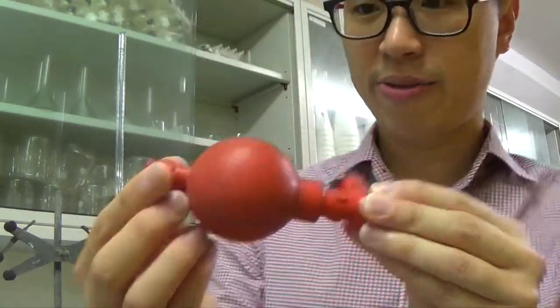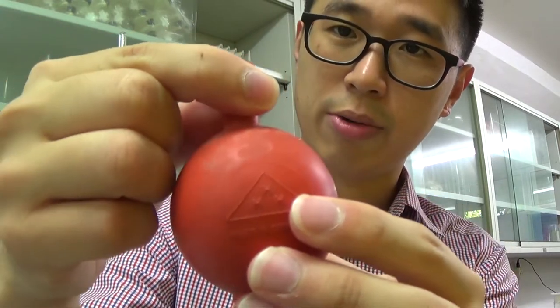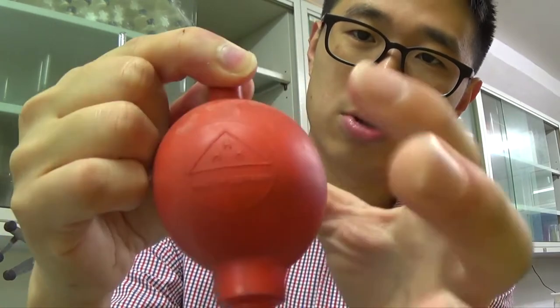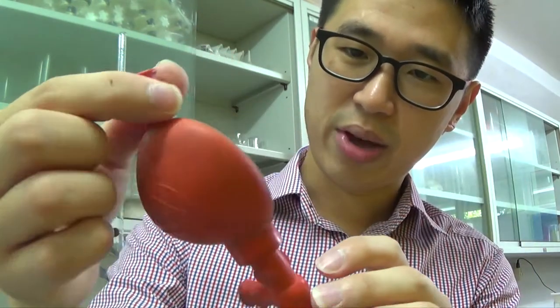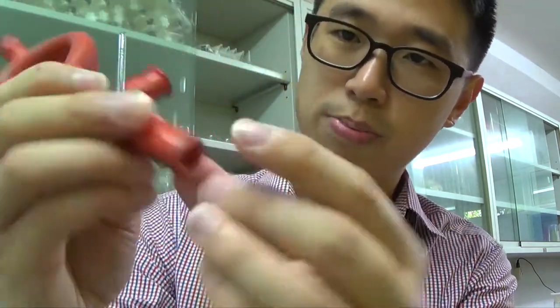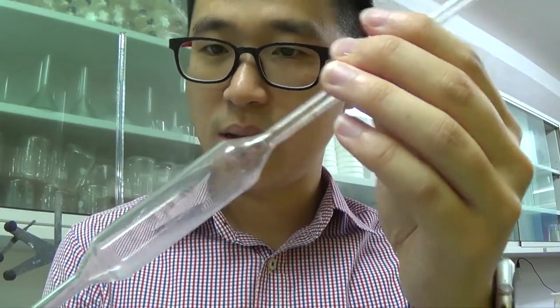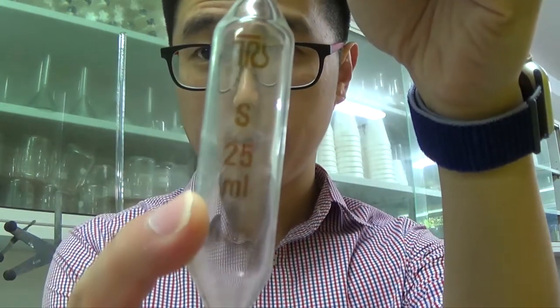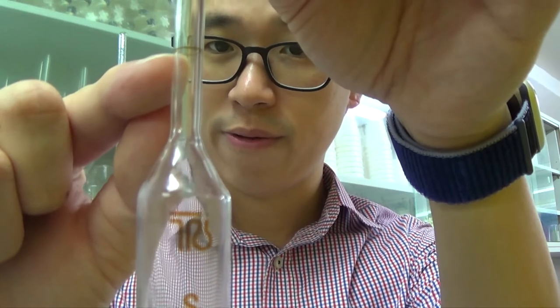This is a pipette filler. It's like a pump. It's got a symbol A there to represent air: when you press on it, you compress the bulb to expel air. Then this is S, which stands for sucking, as you put this onto the pipette. This is a pipette, and this says it is a 25 mL pipette, or 25 cm³ pipette. As you can see, there is a line there where it fills all the way to 25.0 mL.